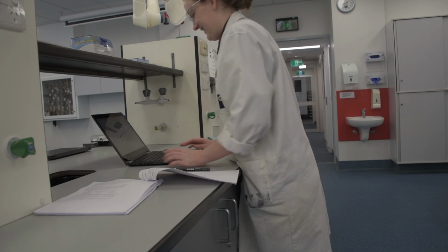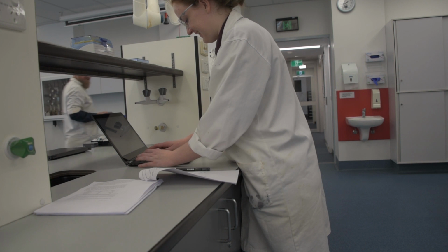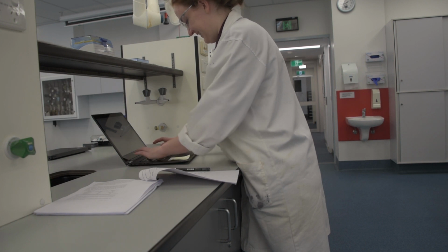Again, in this practical, please remember to calculate your concentration of potassium all the way back to the soil sample, and don't forget to propagate your uncertainty.